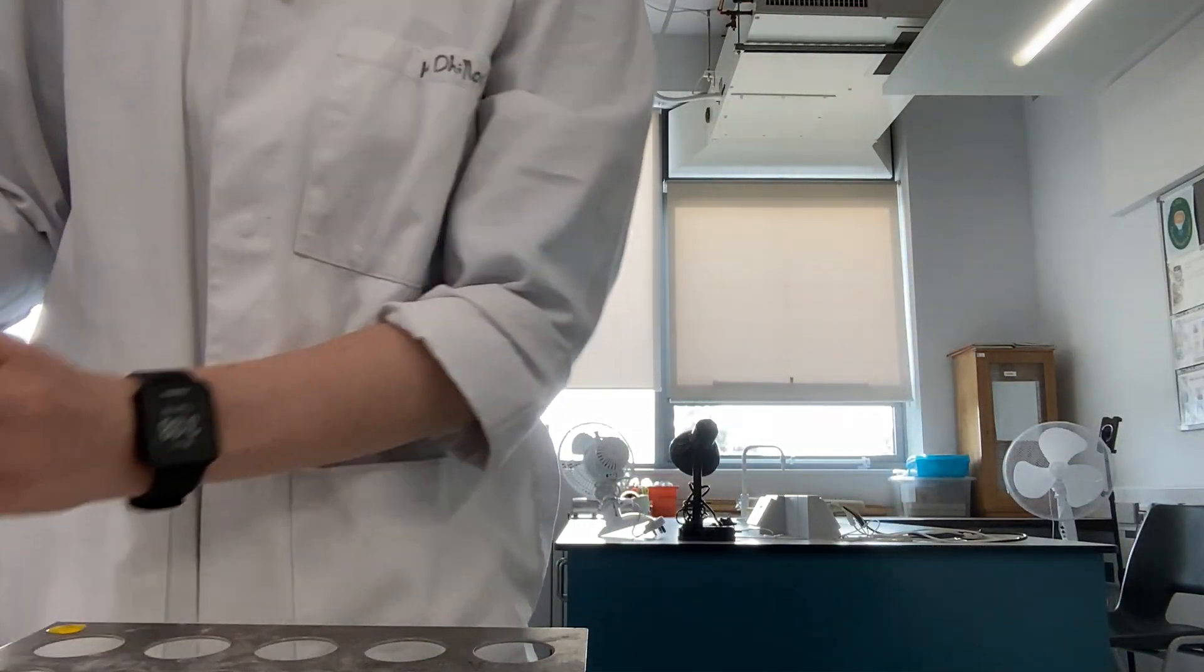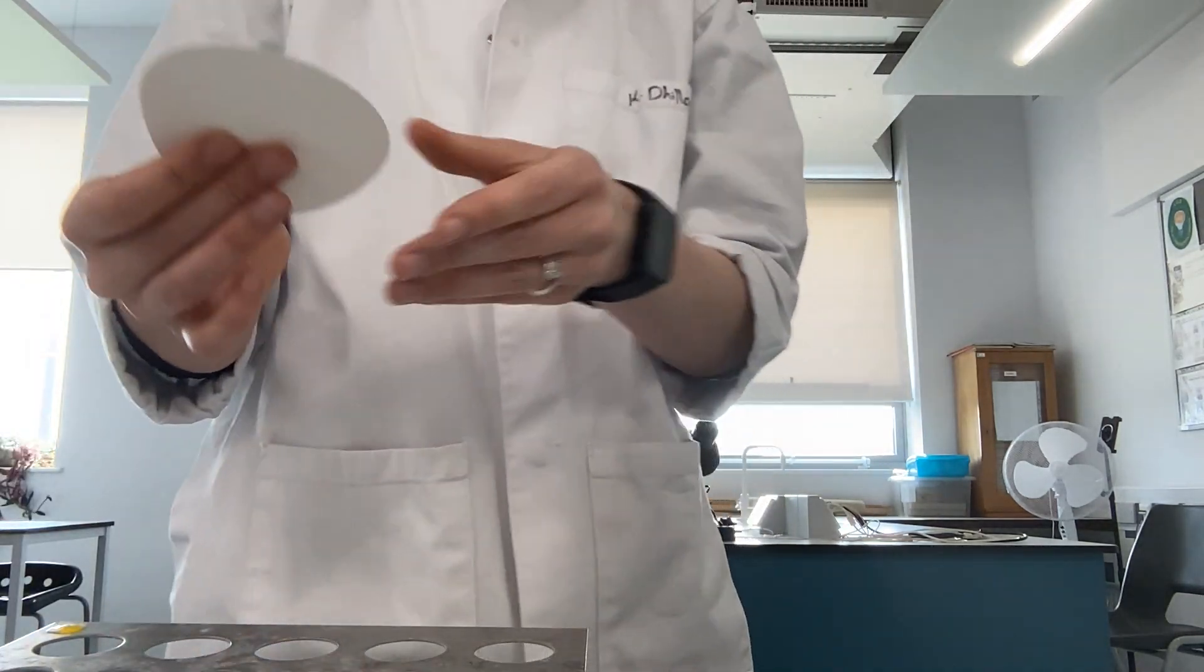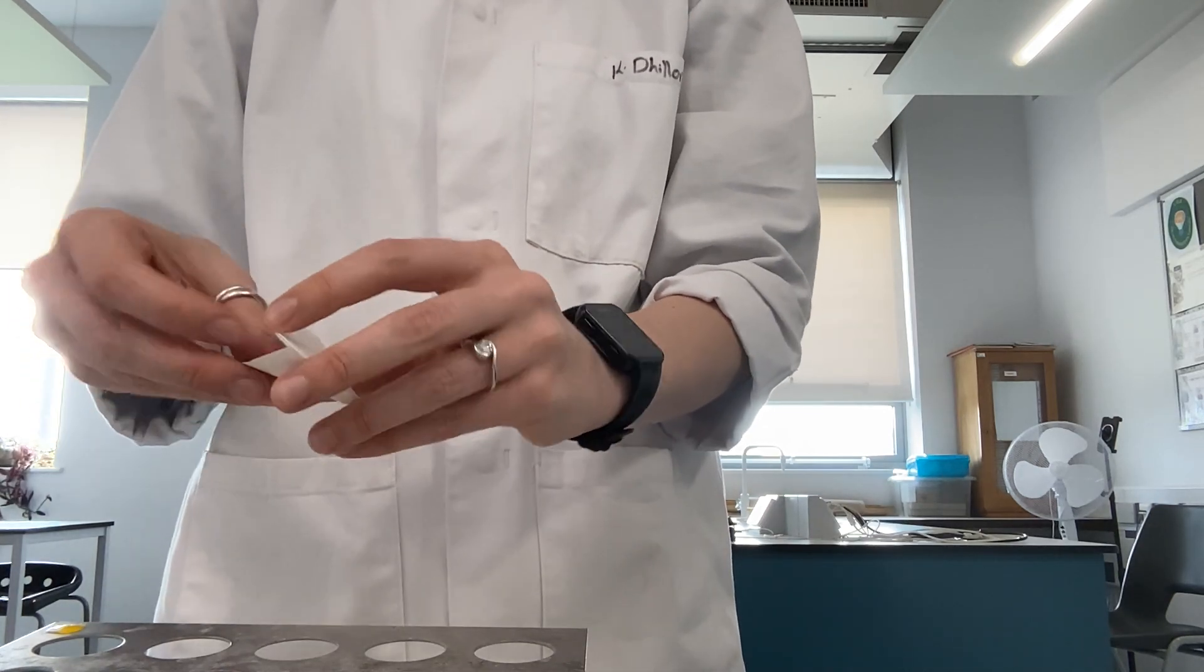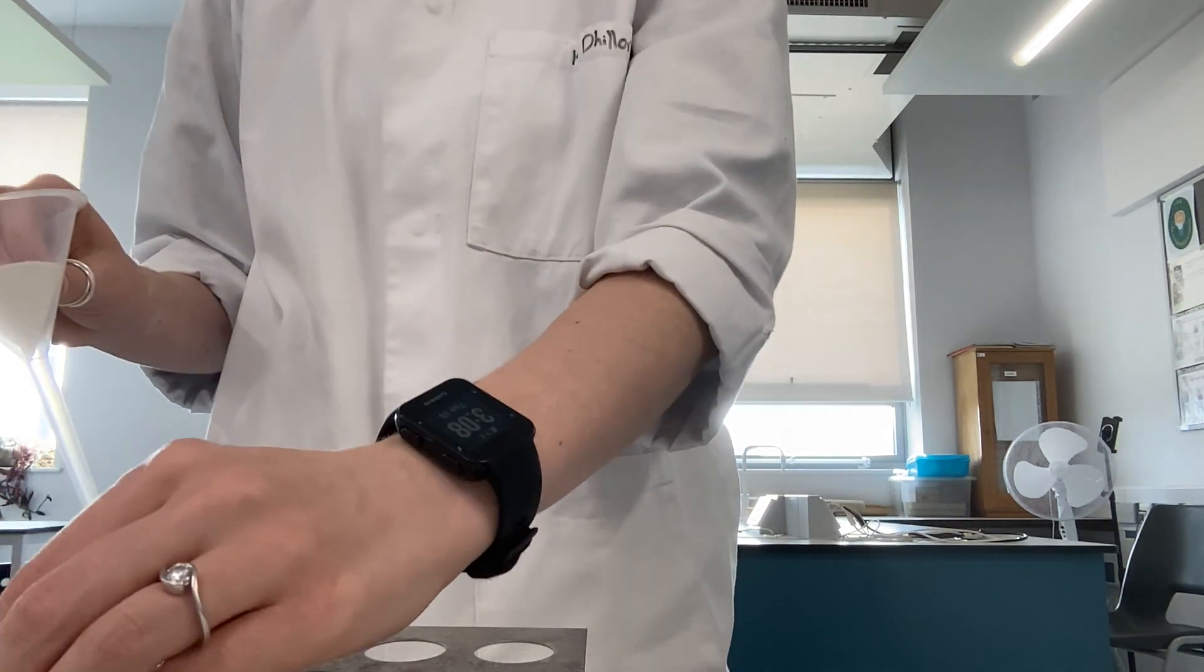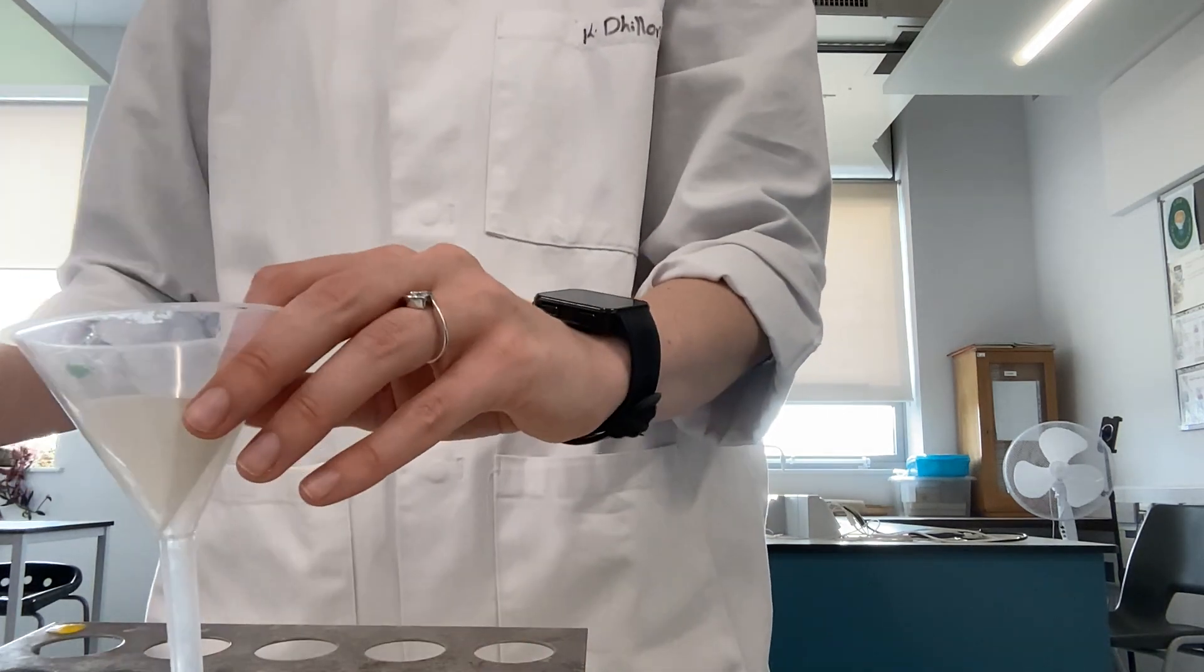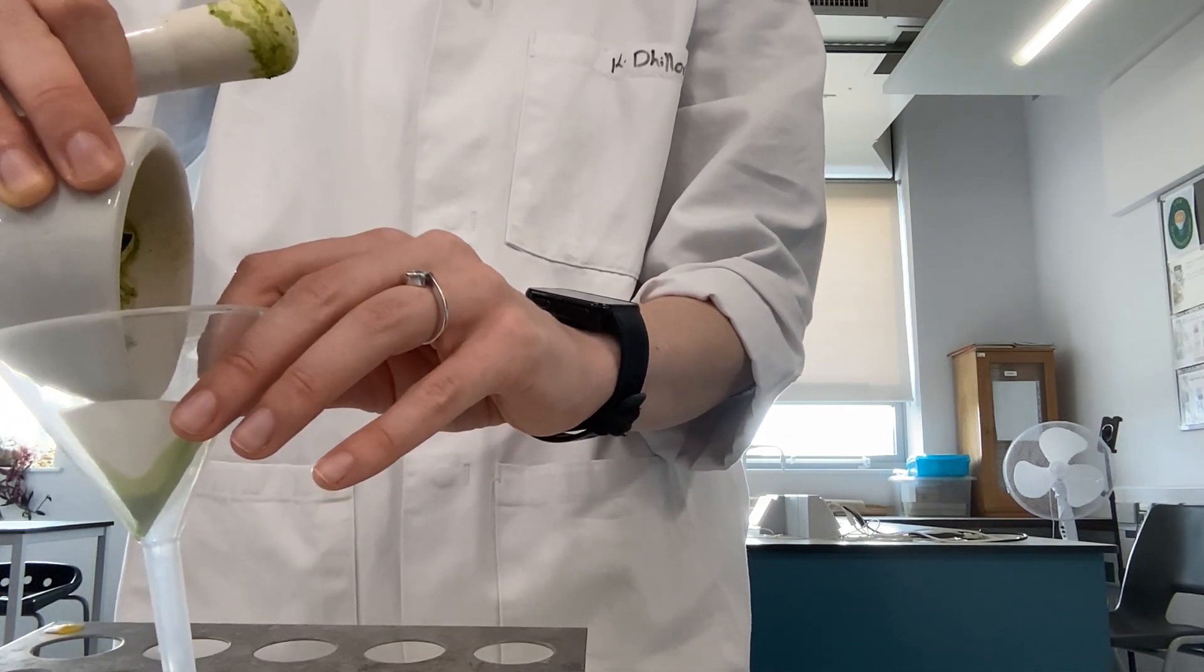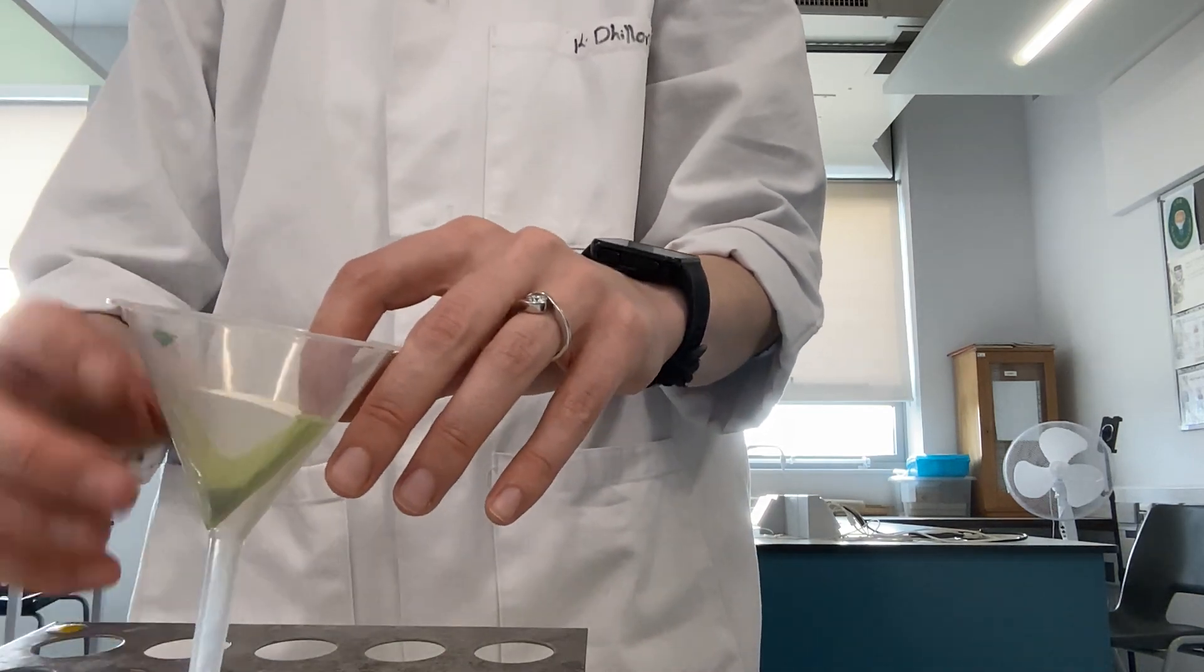Now that I have ground up my paste, what I need to do is filter this through. We take some filter paper, fold it in half, fold it again, and then open it up into a cone shape. Put this into our funnel, which we'll then put into our small tubes. I will then take my pestle and mortar and pour the liquid into that filter paper, and we'll wait for that to filter through into the tube at the bottom.